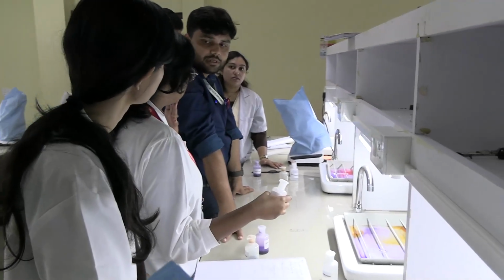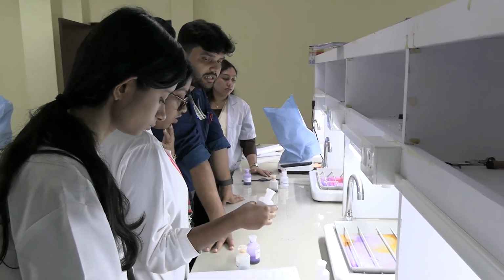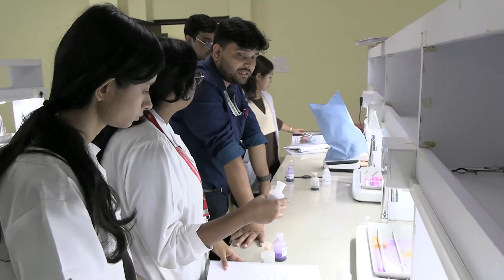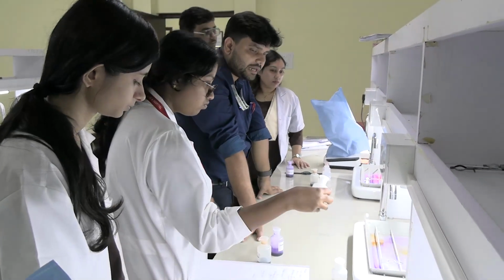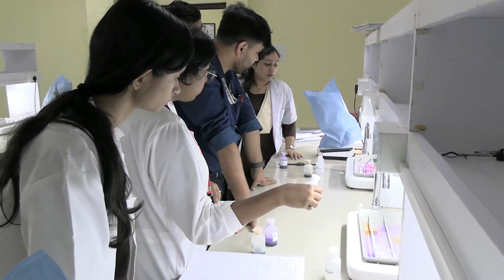Sir, that is primary stain. No, in case of counterstaining, what is the other dye that you can use? Safranin and Carbol Fuchsin. Okay. So you're gonna add the safranin. So you can add the safranin now.